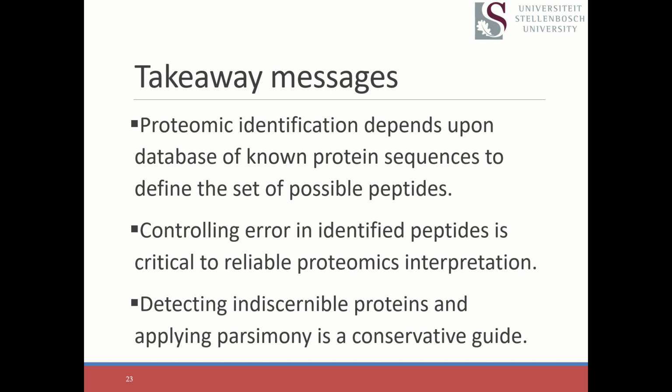Okay, so those are the three parts: database search, FDR control, and protein inference. We all rely on them every day, so it's really, really important that you understand them, and that will protect you as you try to understand what your data mean.